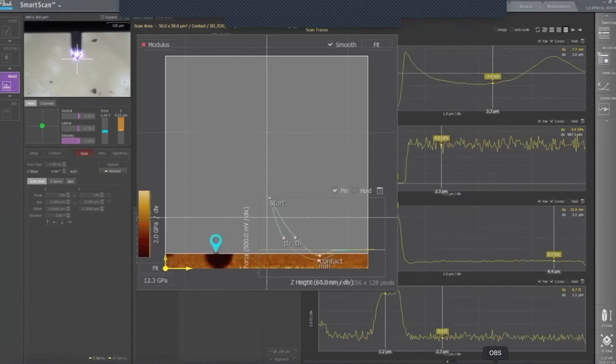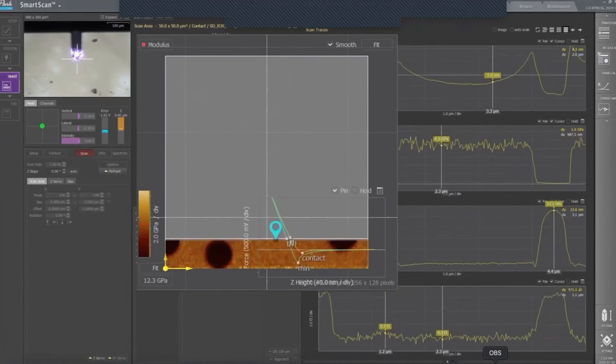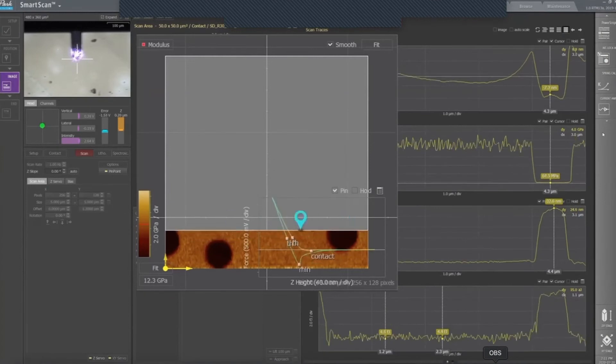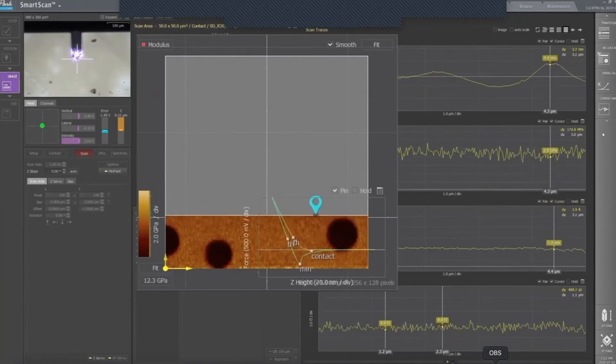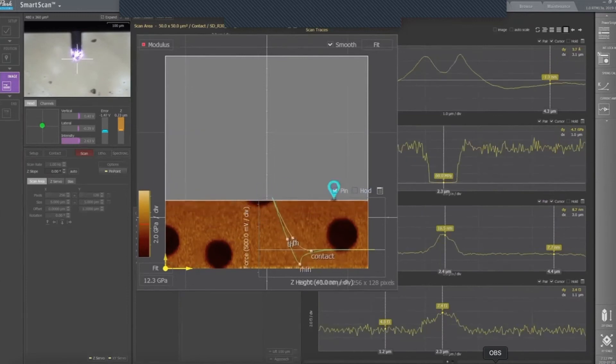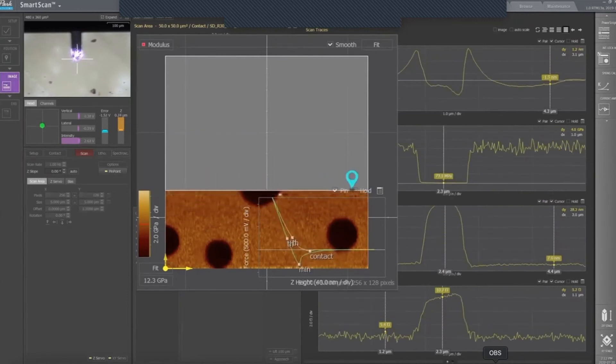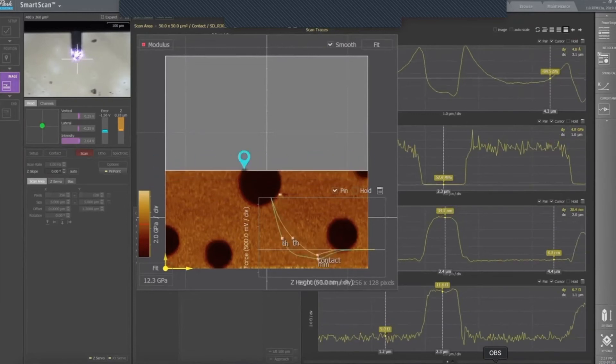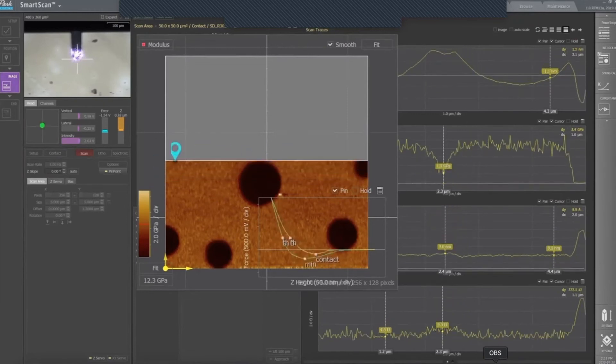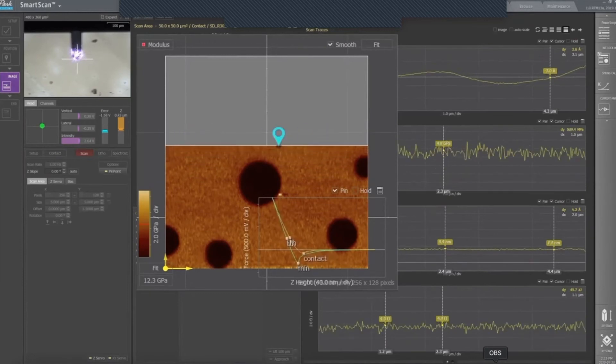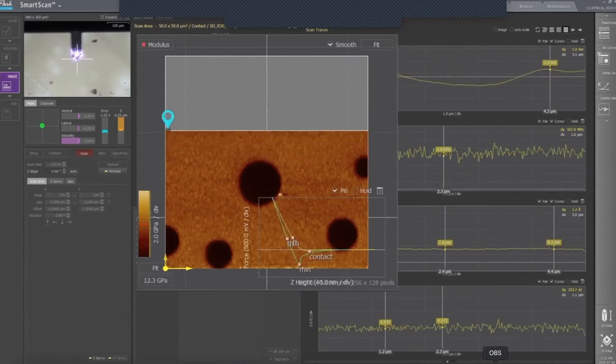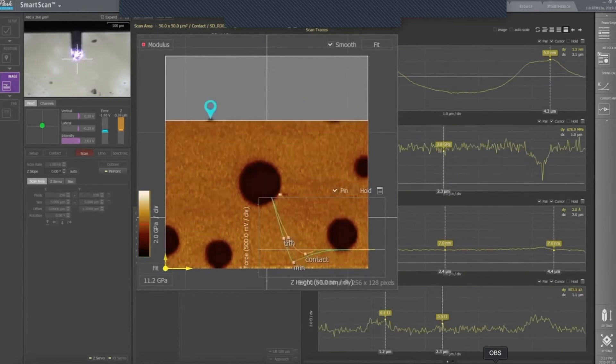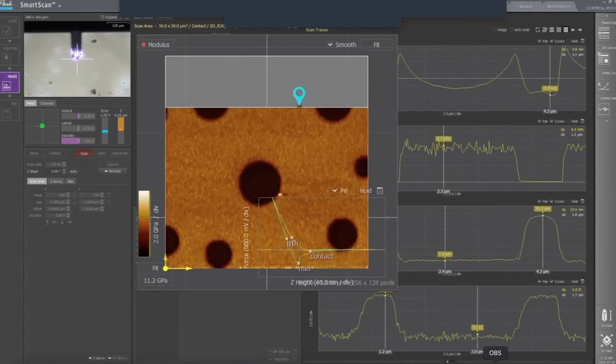When the scan is running, you can track some of the channels in real-time. For example, let's take the height, modulus, and deformation. In the modulus channel, you can see that the measured modulus of a lower hardness mixture blend, which appears as circular pits in the PinPoint modulus image, matches the theoretical modulus of the polyethylene elastomer, which is approximately 100 MPa. The other part of the sample corresponds to polystyrene, which shows a modulus on the order of gigapascals.